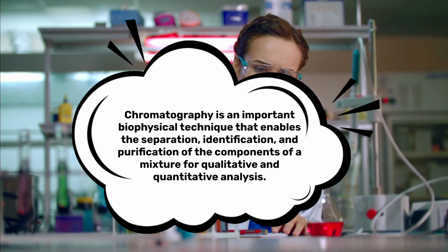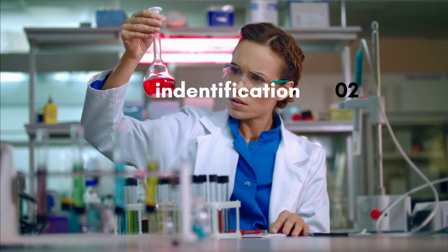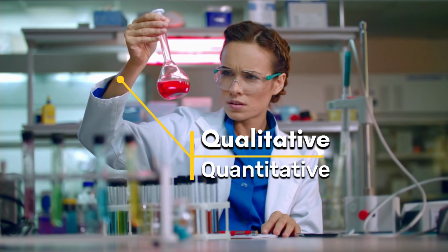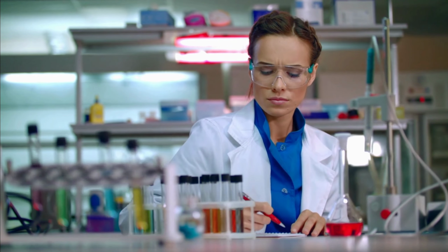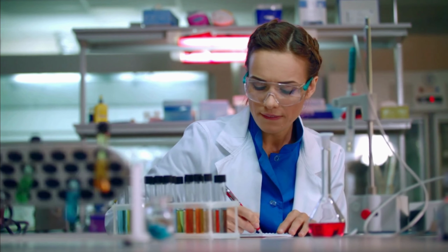Chromatography is an important biophysical technique that enables the separation, identification, and purification of the components of a mixture for qualitative and quantitative analysis. Chromatography is a very useful technique as it allows the separation of components of a mixture on the basis of their nature, structure, size, and other properties.